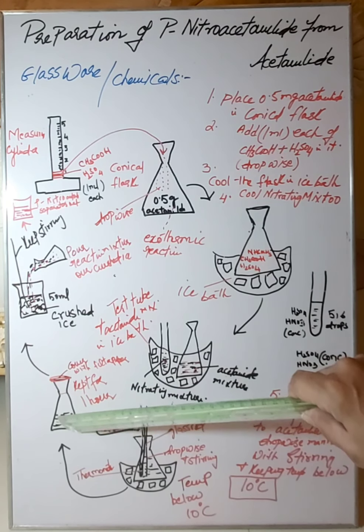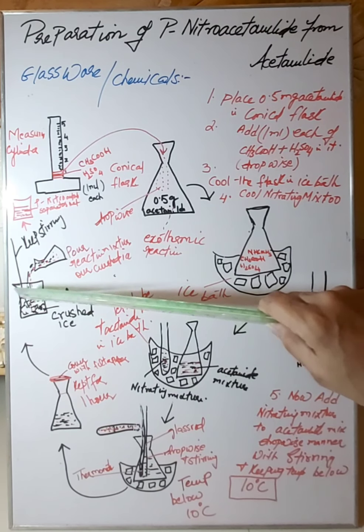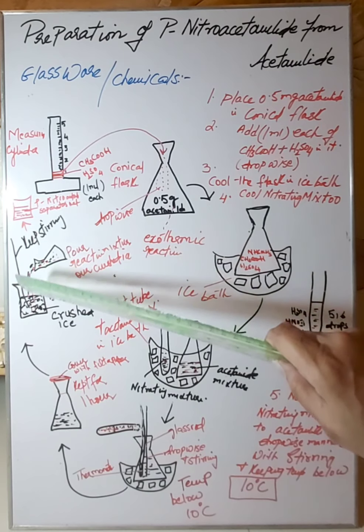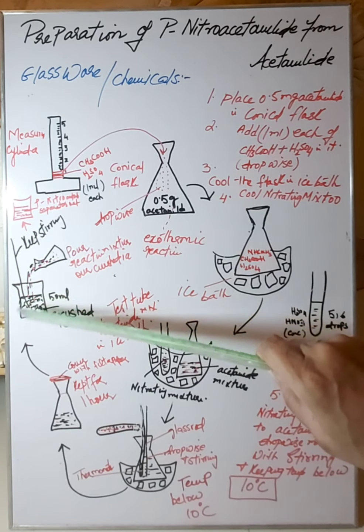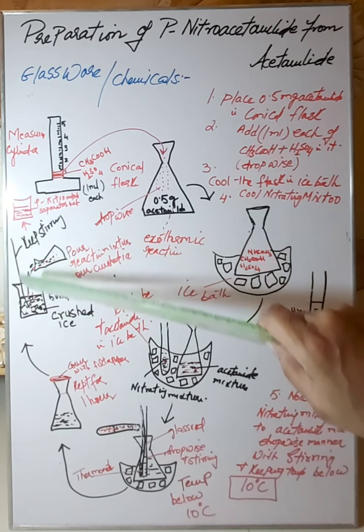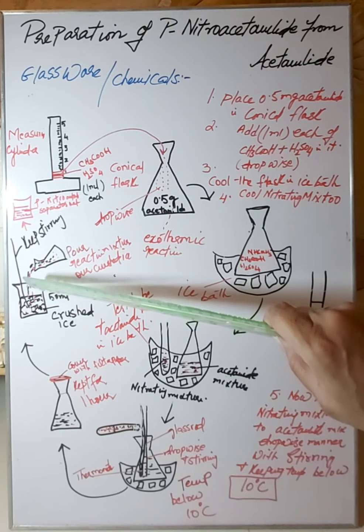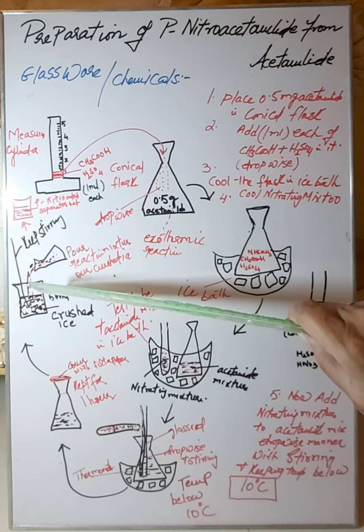After 1 hour, you are going to prepare a 50 ml solution of distilled water containing pieces of crushed ice. It should not be more than 50 ml. You can see here 50 ml. Now you have to pour this reaction mixture over the crushed ice, slowly and gradually, while stirring with a glass rod. Keep stirring on when you are adding this reaction mixture over the crushed ice. You have to stir very nicely, and in 5 to 10 seconds, you are going to see crude para-nitroacetanilide as a yellow precipitate.